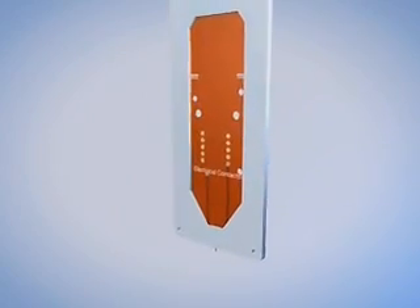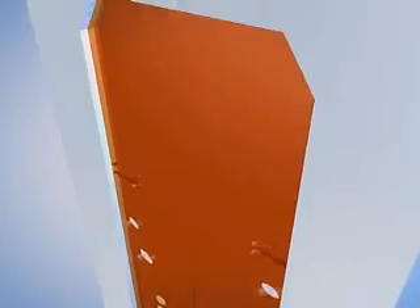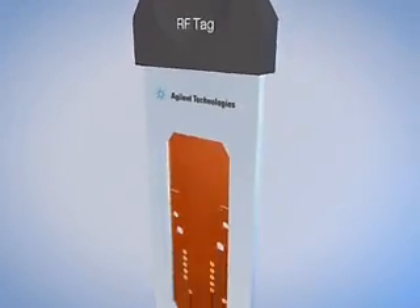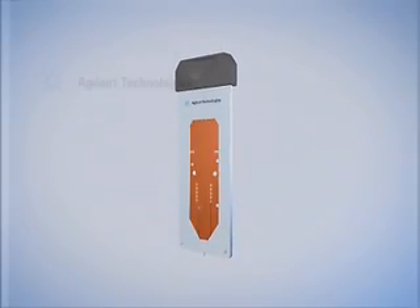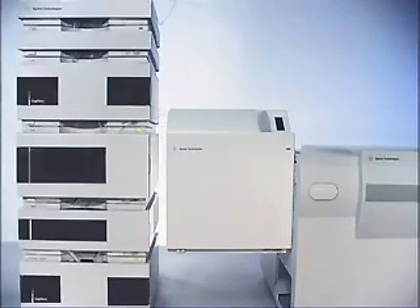The HPLC Chip also integrates all electrical contacts for electro spray tip voltage and features an embedded RF tag that tracks the usage and operating parameters of the chip. The second component of the system, the HPLC Chip Cube-MS interface, includes an electro spray ion source with optics for spray visualization, HPLC chip loading and ejection mechanism, nano-LC connections and micro-valve switching.